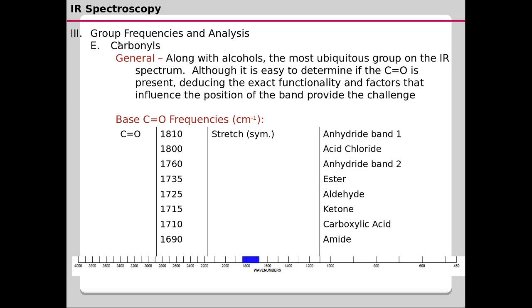Okay, good morning. In the last class, we discussed the IR spectral features of sp3 hybridized oxygen and nitrogen in functional groups such as OH and NH2, respectively.